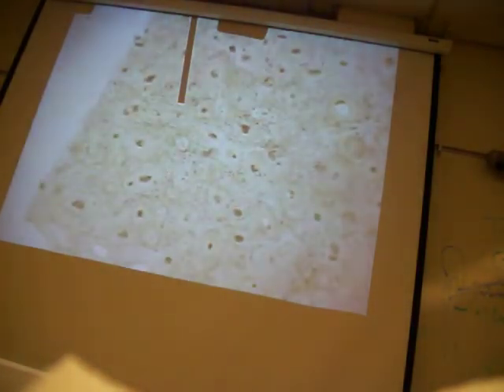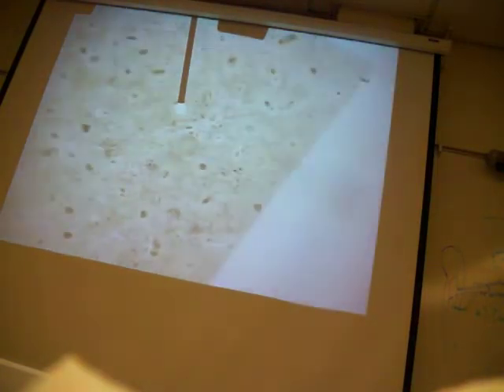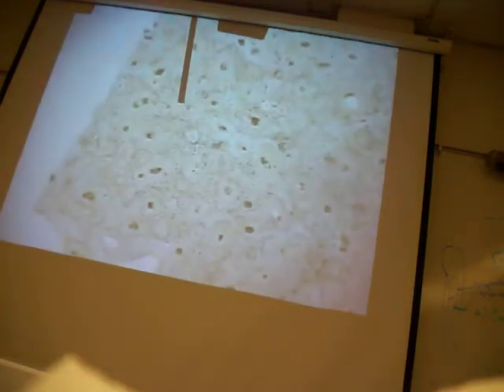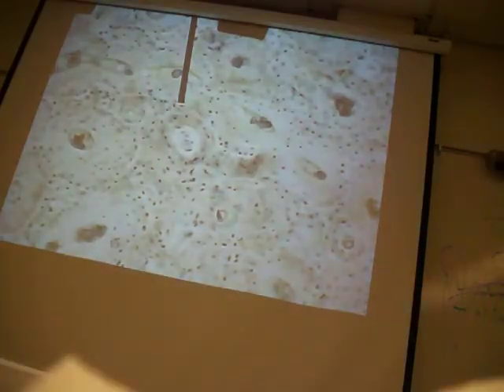Now, all of these osteon canals are interconnected with each other. So you can think of these, there are a bunch of these parallel canals running the length of your compact bone. Right? So these osteon canals are connected. This one just happens to be more clear looking.